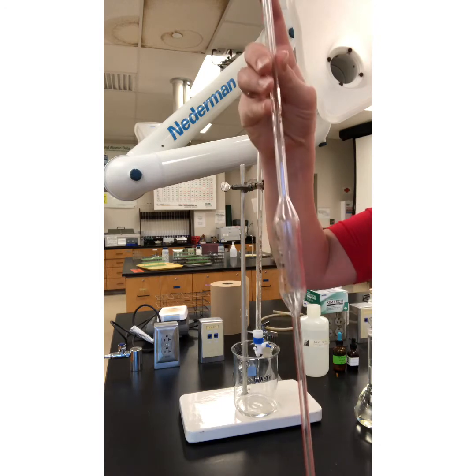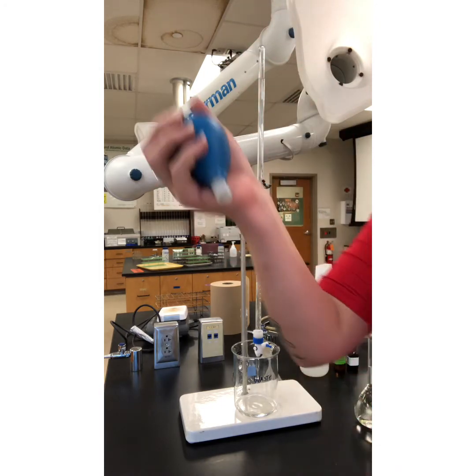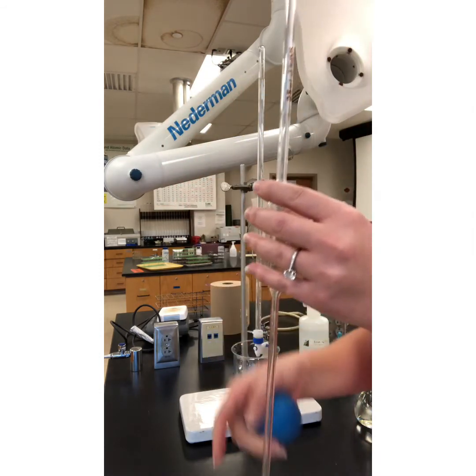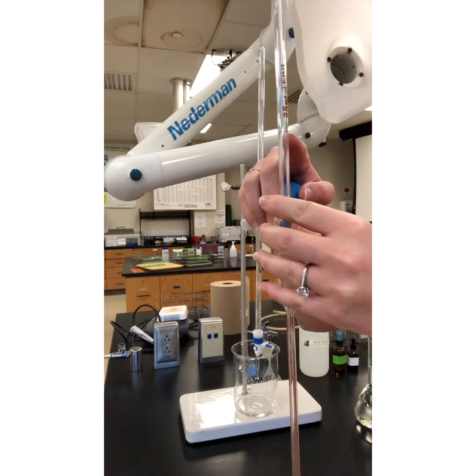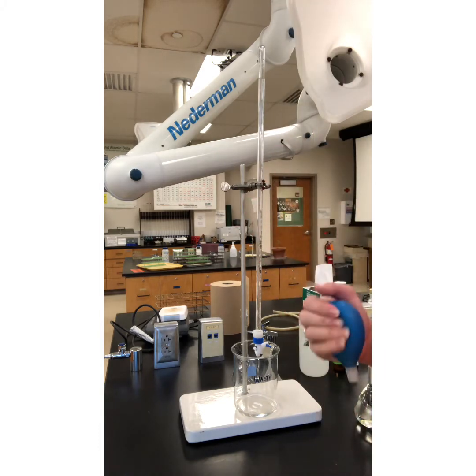So we're going to use suction to draw the solution up with our bulb, little squeezy bulb, super high tech, and we are going to suck the solution up until our meniscus is exactly at the line that indicates that 25.00 milliliters, which takes a lot of practice to be good at. It's such a pain in the butt.